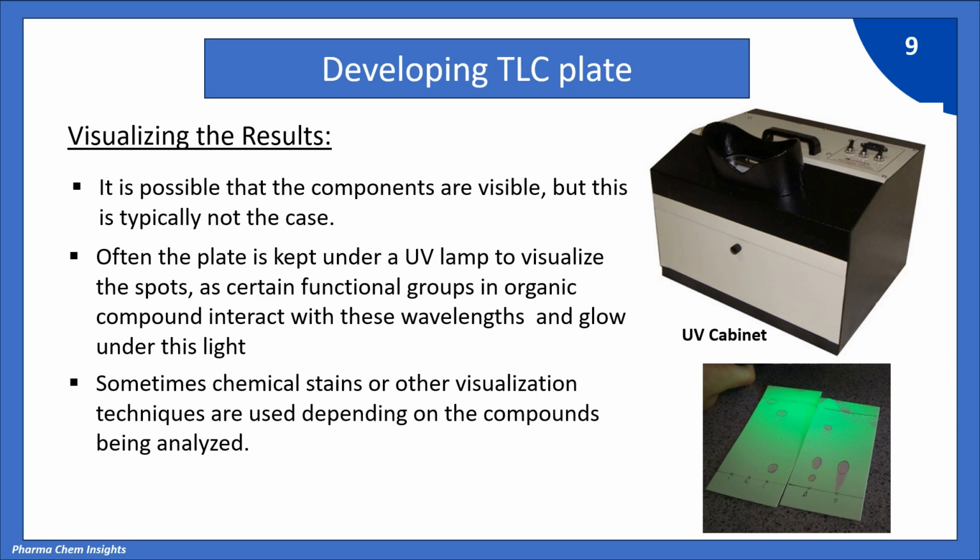You can see the image on the right hand side of UV cabinet, and below that image there is an image of TLC plate representing the spots which you can see when you keep these plates under this UV cabinet. Simply trace these spots.